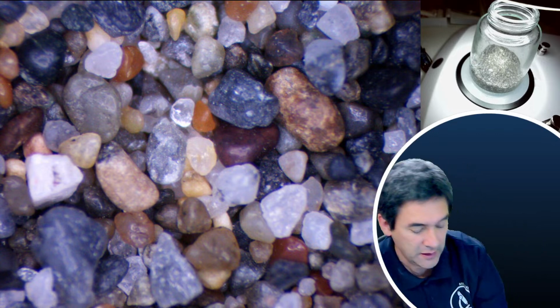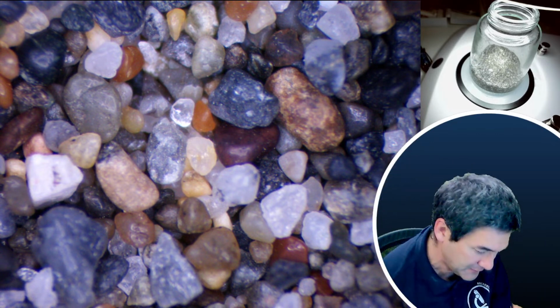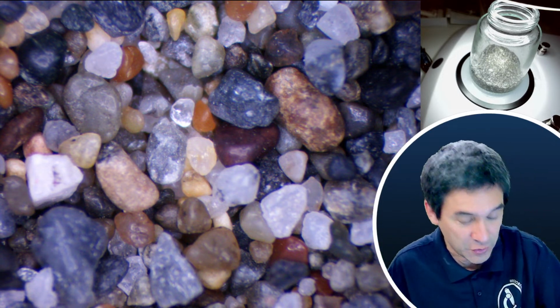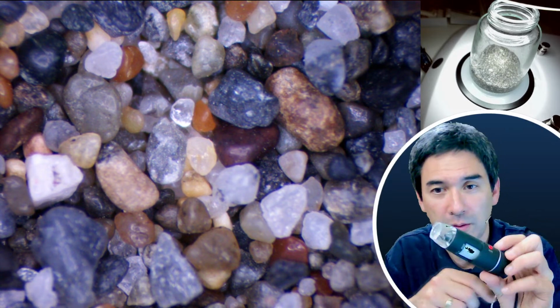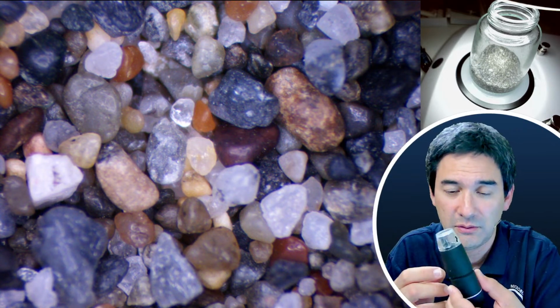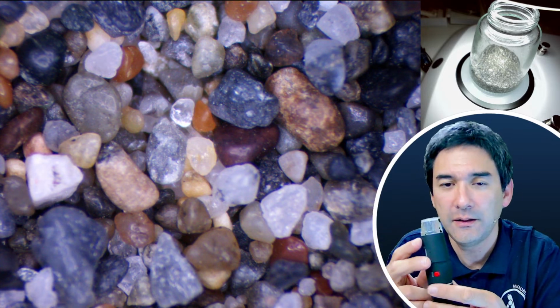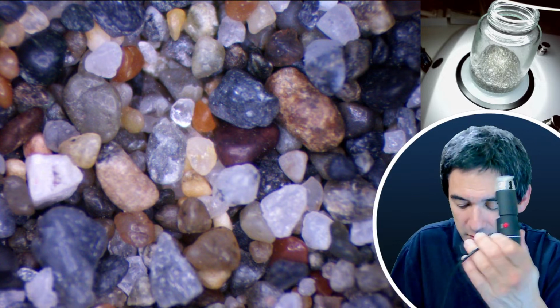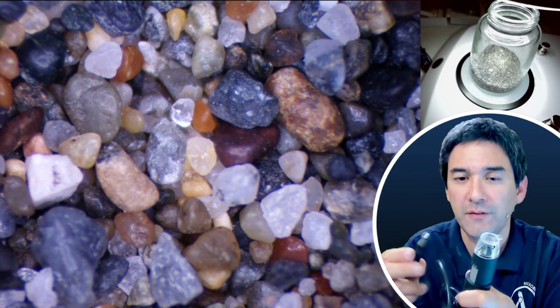So if you don't have a stereo microscope, but you want to get a stereo microscopic effect, and you don't want to spend so much money on a stereo microscope, I can recommend the following. This one here was less than 10 euros, I think 7 euros even. It was ridiculously cheap. And this is a USB camera. Unfortunately, there is some issue with it. I've had it for a couple of years. Otherwise, I would have actually shown it to you.